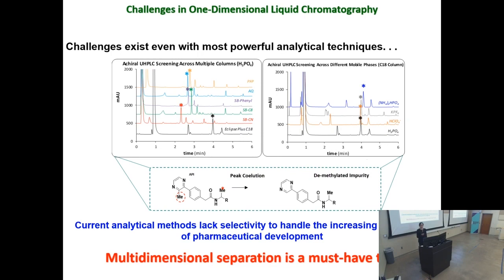It co-elutes with a demethylation byproduct under our screening conditions. So in this case, we thought multi-dimension separations might help to monitor this reaction.